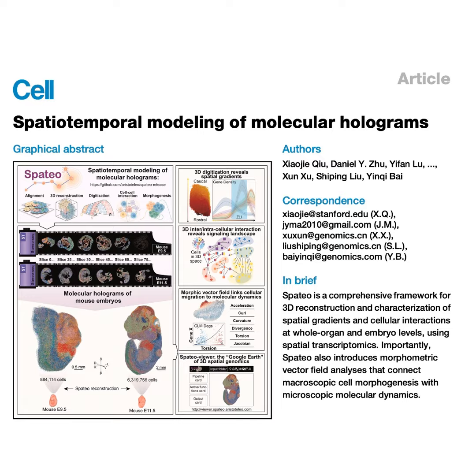So rather than applying a single mathematical transformation to the whole image, a Gaussian process models the probability of deformation across the entire surface. It analyzes the spatial coordinates of gene expression patterns, looking for identical biological landmarks between 2 adjacent slices. Oh, so it's looking for the exact same cluster of specific neurons in both slices. Right, and then it calculates a customized vector field of deformations. So it identifies that, say, a cluster of neurons is slightly stretched in slice 2, and it mathematically pulls just that localized region back into its proper biological shape, matching it to the footprint in slice 1.